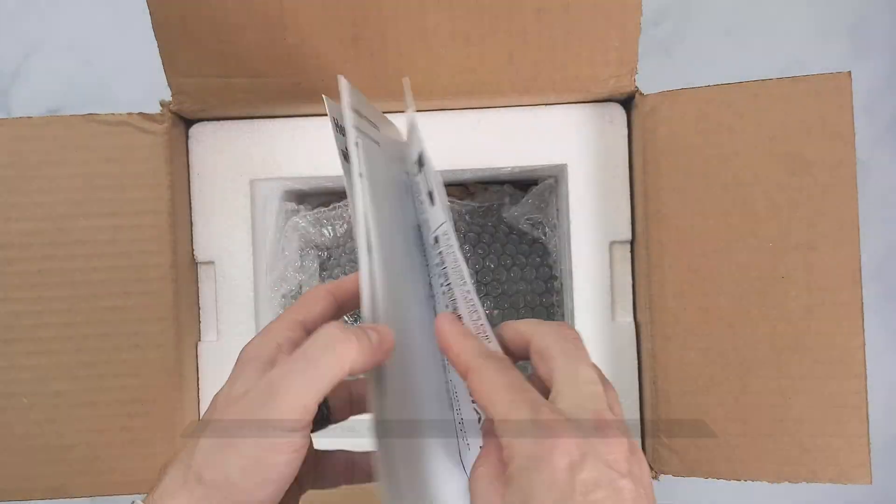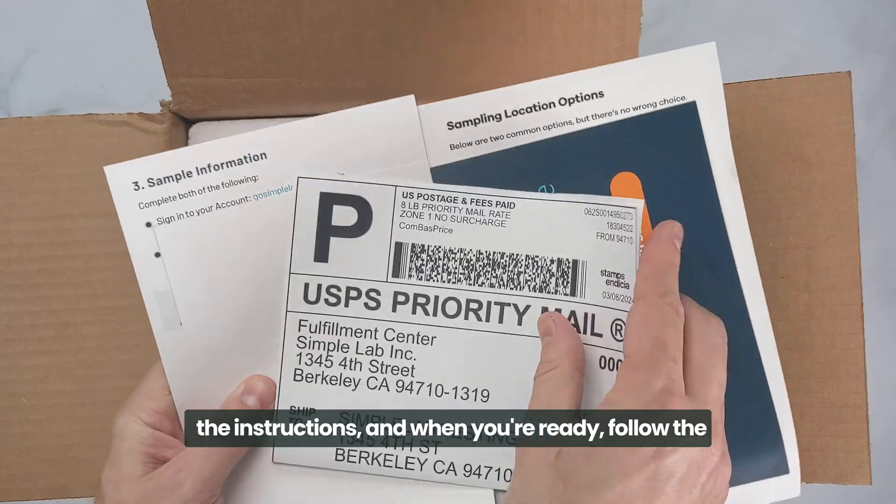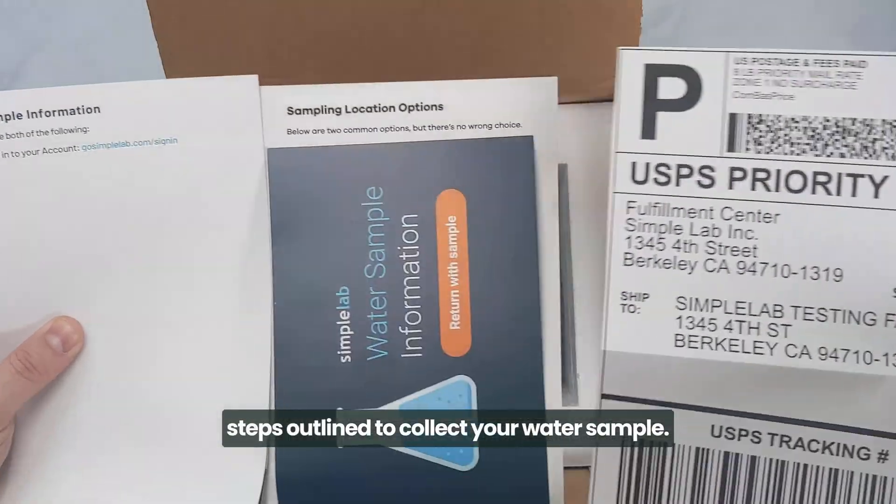Take your time to read through all of the instructions, and when you're ready, follow the steps outlined to collect your water sample.